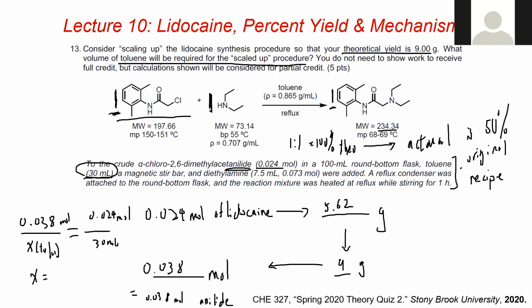So say the ester we are making in the experiments we've done in this course is 1-to-1 of the acid and alcohol. But the recipe calls for like 1-to-2 because we want to have some excess to drive the equilibrium to the right.